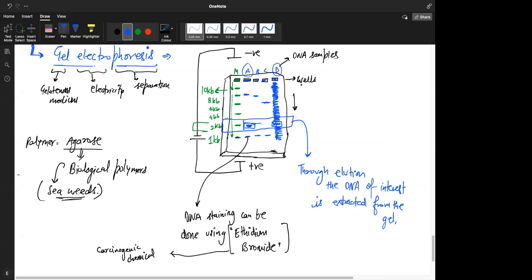So that experiment is failed. Other thing is what I did, you can just join the different electrodes to different sides, and all your DNA can just jump off the cliff and go away. Or else you used higher voltage than required, and you ran it for 20 minutes. By the 20 minutes, the DNA is either out, or you ran it too less.